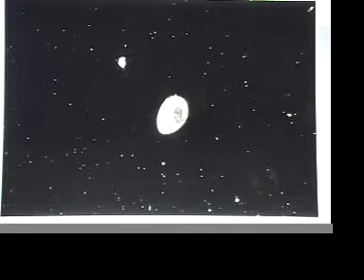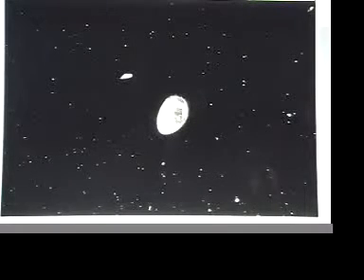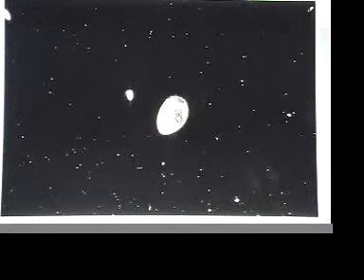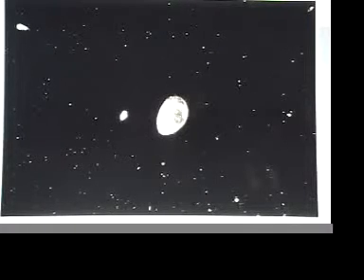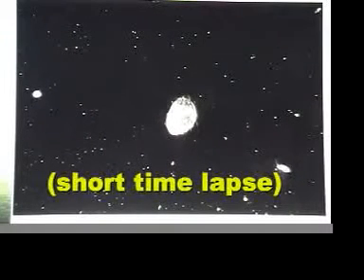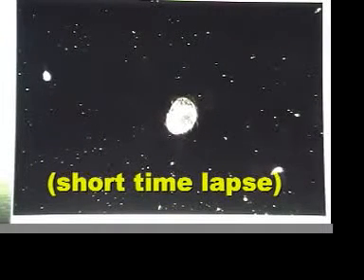There's a kind of a glittering background effect going on. It's quite interesting. There's a tiny organism nearby with a little flagella. You can see the flagella. Very interesting. It looks great on the computer screen. Let's see what kind of action we can get going here.